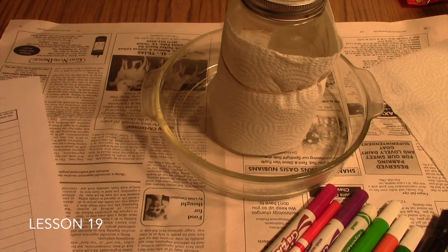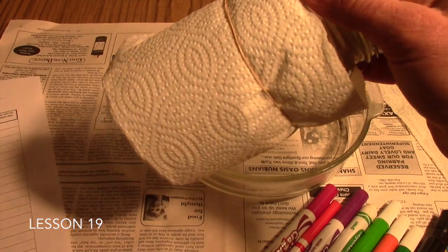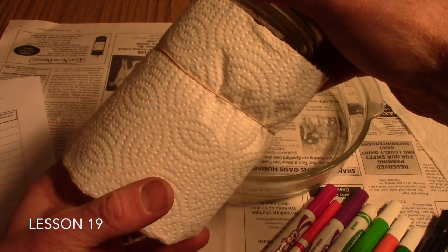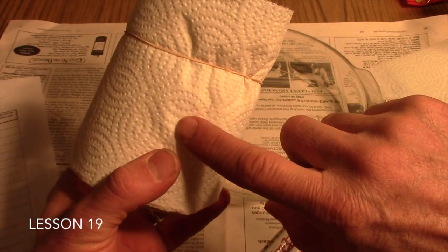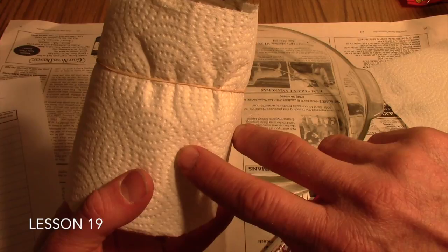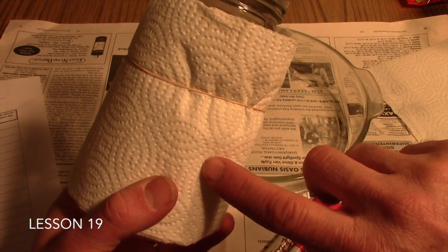Equipment that you'll need for this lab includes paper towels or coffee filters. It's best to get the whitest paper towel with no other inks on it that you can. An alternative to paper towels are coffee filters.